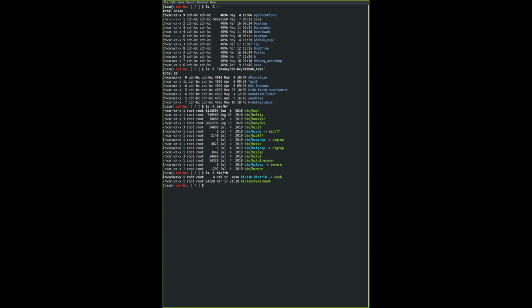Okay, with that, you can now do the activity. Yes. I'm getting an illegal option command. For which particular one? I tried ls -l bin /a asterisk. Yep, and I'm getting illegal option.